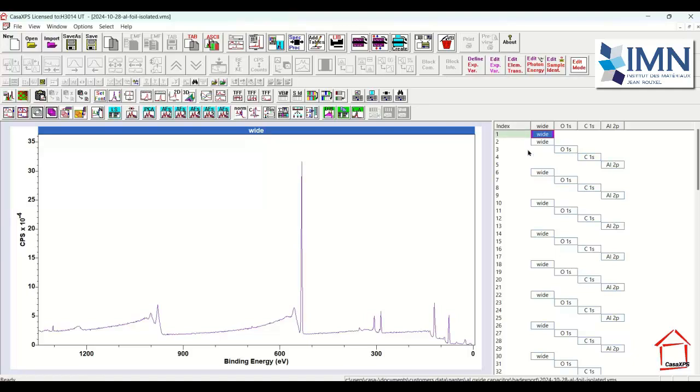The format is a set of VAMAS blocks and they have been ordered according to an index. So the experimental variable is the index of each one of these VAMAS blocks in the VAMAS file. That is to say, the index correlates with the order of the VAMAS blocks which contain the data within the VAMAS file, and may lead you to believe that these represent the order for which these measurements were performed, and it's not true in this case.